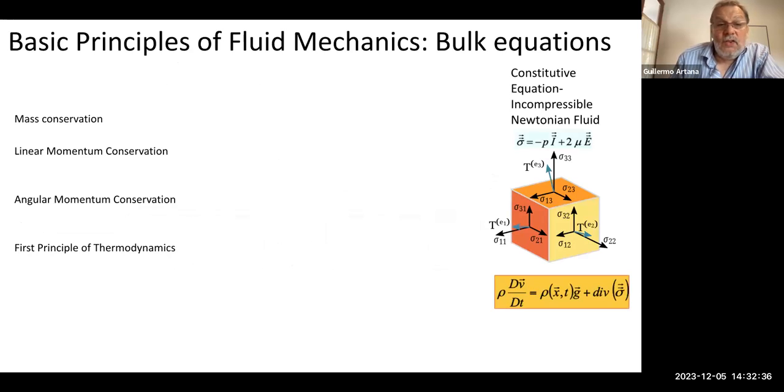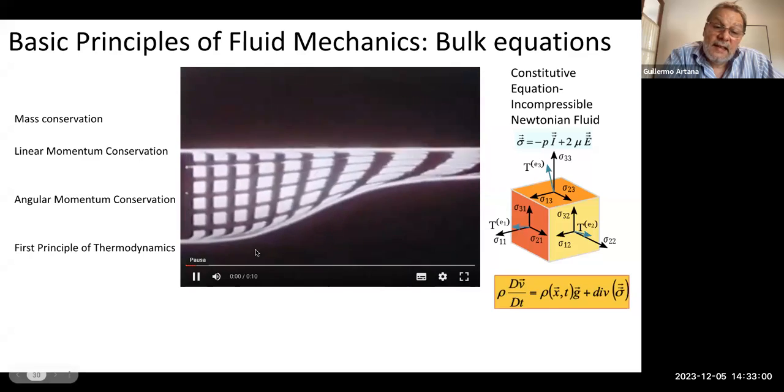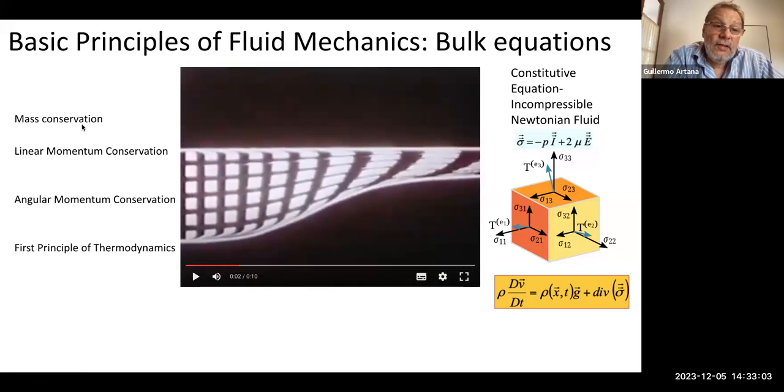So concerning the basic equations that we can use to design these chips, most of them are derived from classical fluid mechanics, in which we express mass conservation, and we can apply in this kind of problem the incompressibility condition.